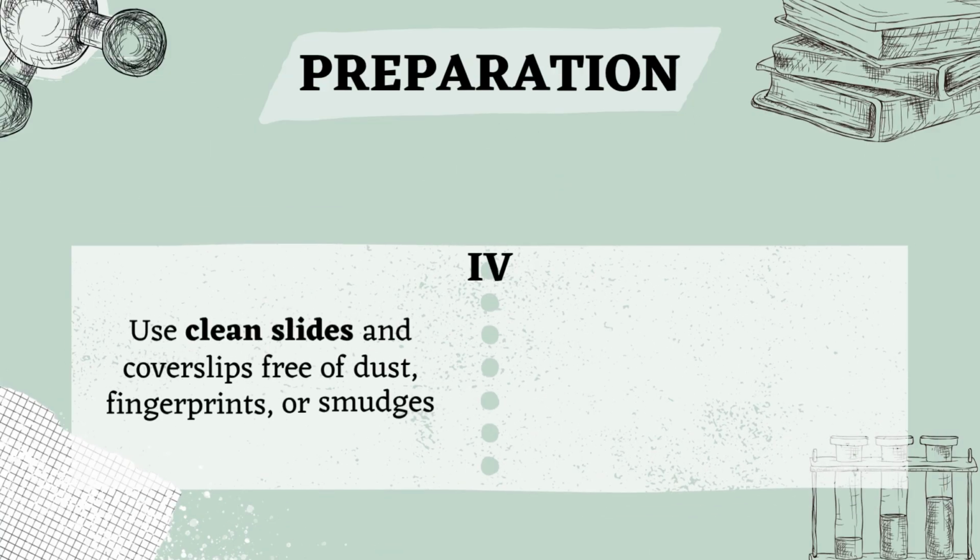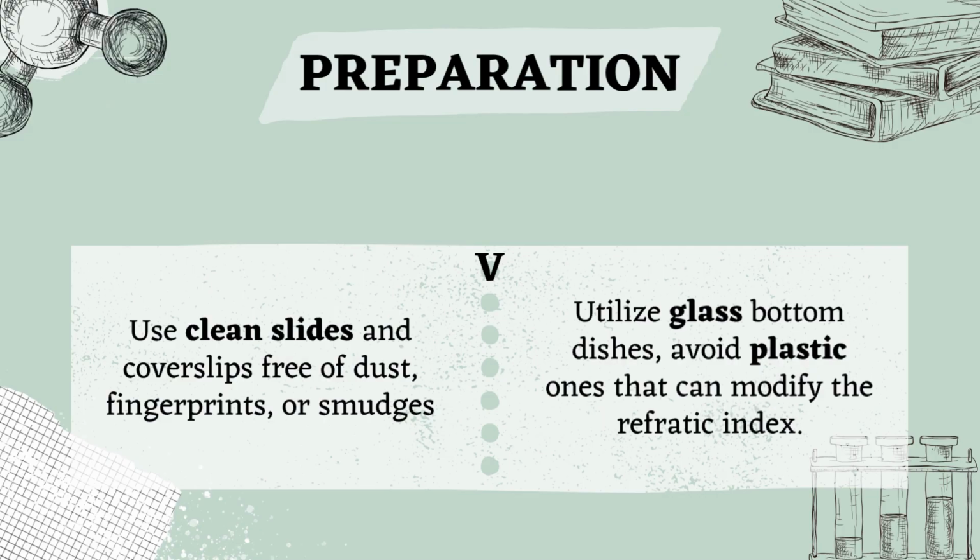And finally, we must use a clean slide to avoid any possible contamination and utilize only glass bottom dishes. Avoid any plastic ones, because they can modify the refractive index by interacting with it. We can obtain in the end a different image than the one we were expecting.